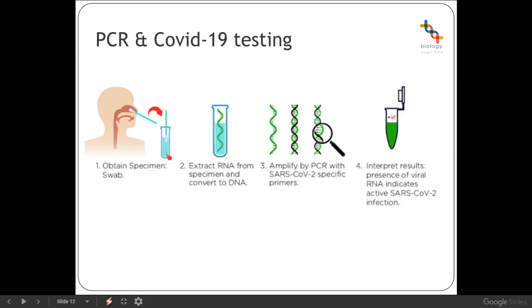That is going to contain a whole bunch of cells. So it's going to contain their cells from the back of their throat, the back of their nose, and if that individual has been exposed to the coronavirus and we can detect that, it will also contain some viral genetic material in here as well. And it's important to realise that in this particular case, the viral material tends to be RNA, not DNA, but don't worry about that for the moment.